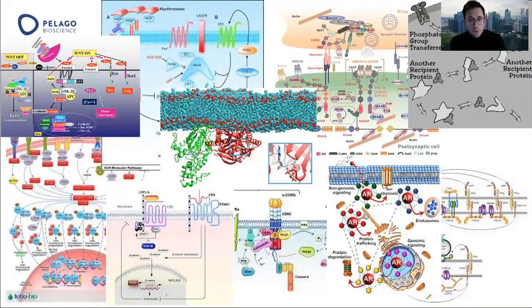Also, these protein-protein interactions, moving from one form, a dimer, into monomers, for example, have consequences on the thermostability of the involved proteins. That's what I said in the previous slide in principle. So you have the interaction surfaces between two proteins. They're usually quite big, and they can supply ample and specific interaction surfaces, which either cost a lot of energy to break or offer a more stable conformation when it's formed.